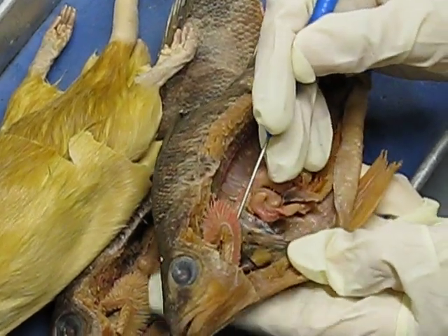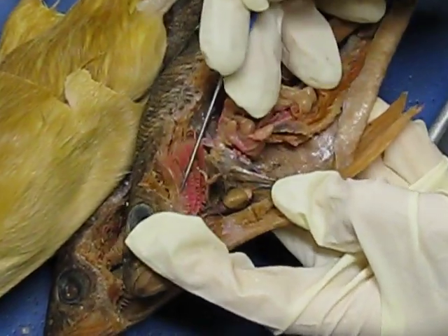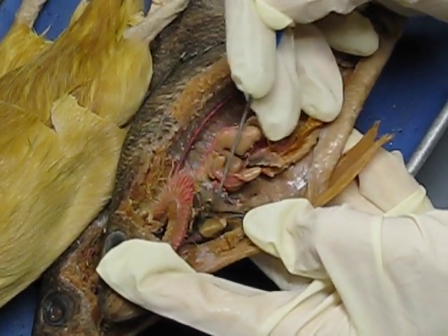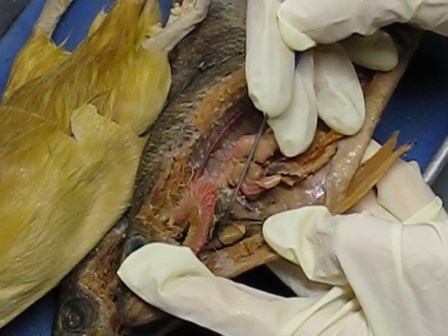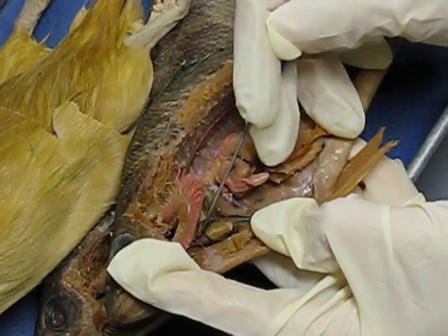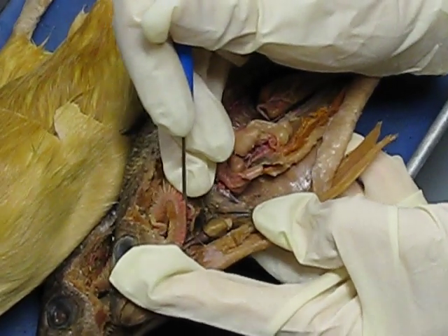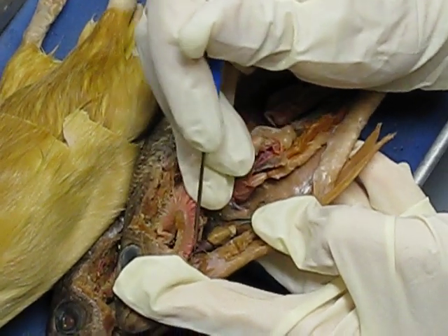Here you can see the heart. This right here is the ventricle. On top you see the black part — that's the atrium. And then the bulbous arteriosus is right here, the one in the front. And then you can actually see the ventral aorta going up that way.